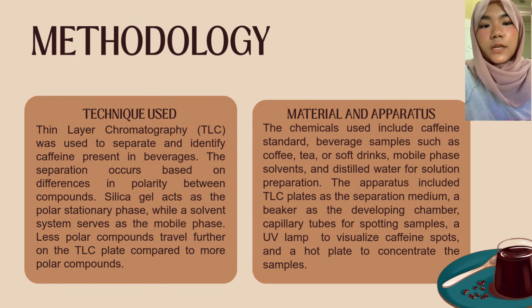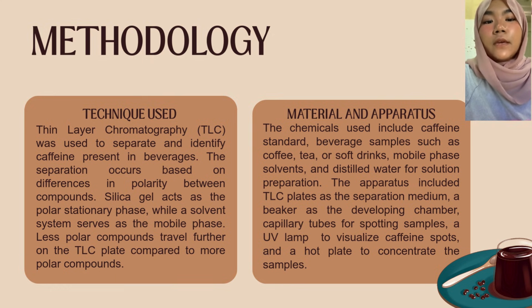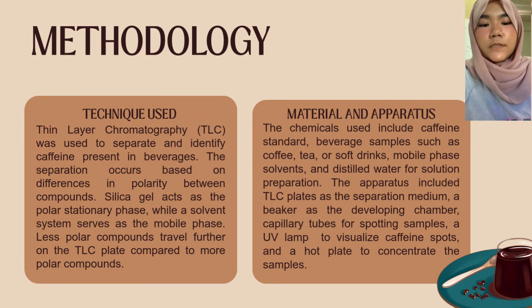Hi, my name is Nur Alana Suha. For this topic, we use the TLC technique. It is used to separate and identify caffeine present in beverages. The separation occurs based on differences in polarity between compounds. Silica gel acts as the polar stationary phase, while a solvent system serves as the mobile phase. Less polar compounds travel further on the TLC plate compared to more polar compounds.